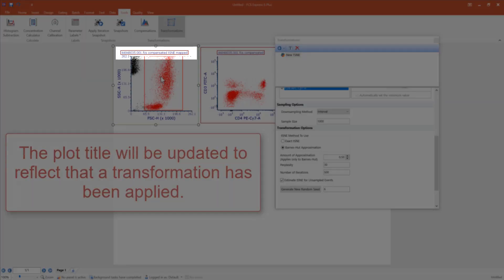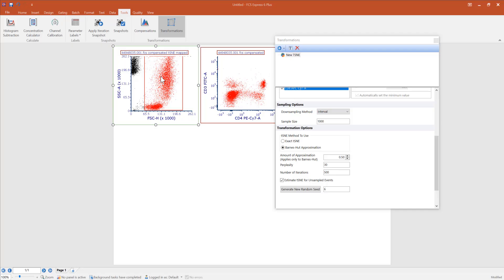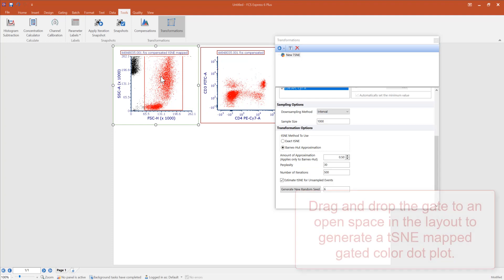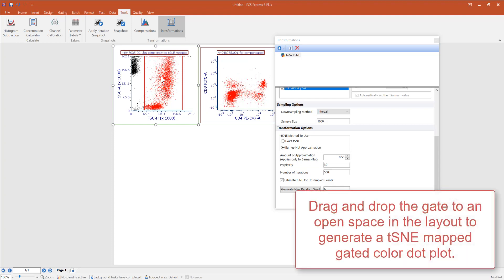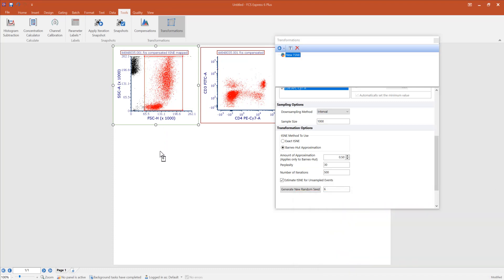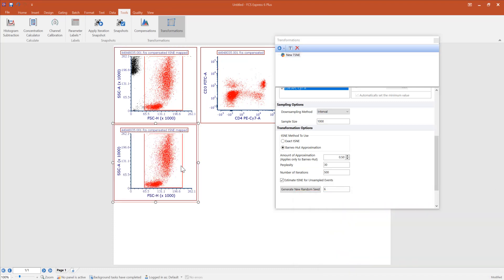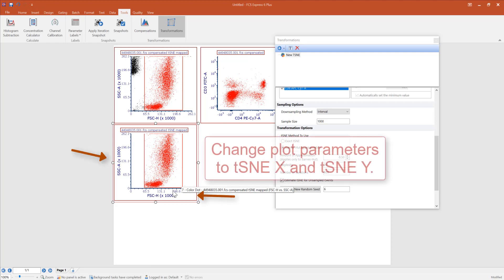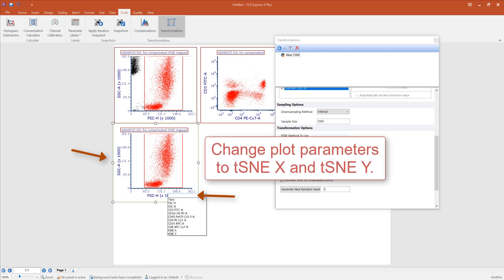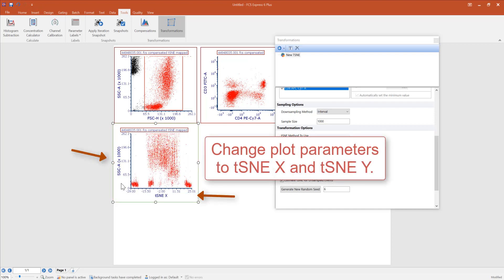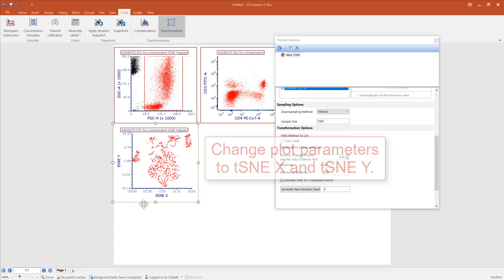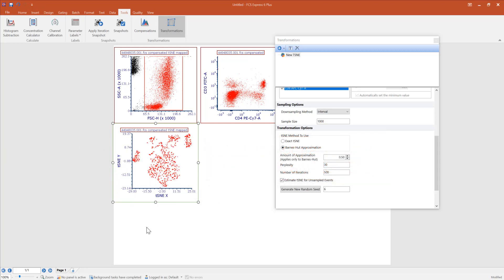If you would like to create an additional plot with this transformation on the previously created gated region, you can drag and drop the gate into an open space in the layout, which will create a gated plot based on the transformed data. You can now change the parameters to t-SNE X and t-SNE Y to display the transformation parameters.